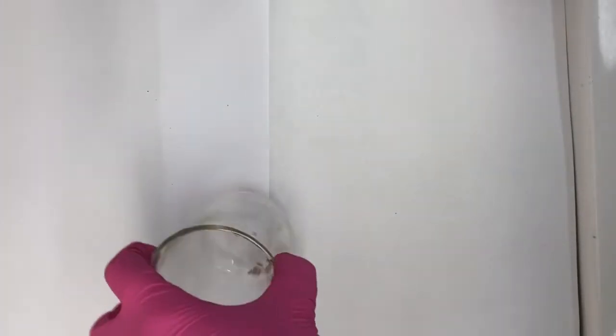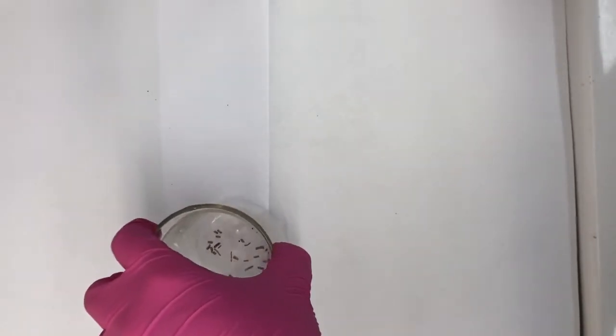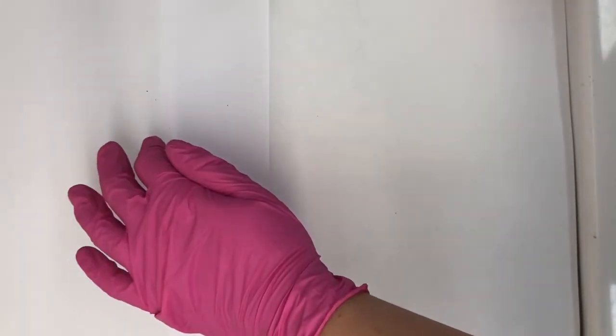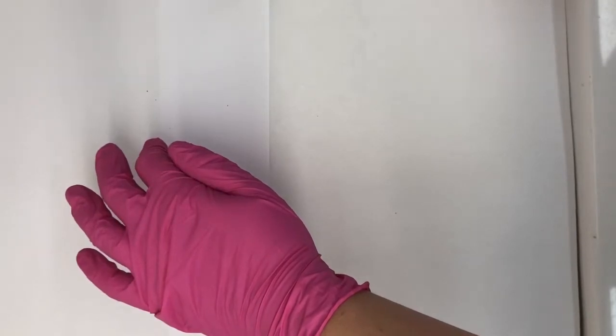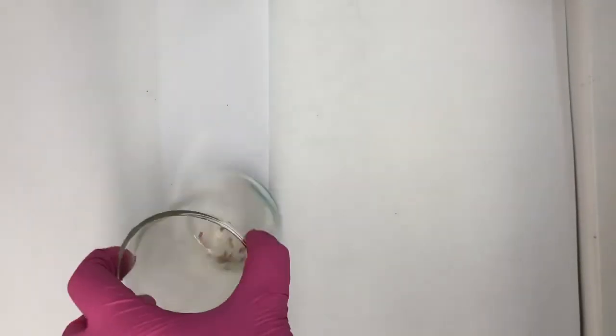Now, it says 40%. I have no idea how long it was up the back of the acids cupboard, which is why I'm carrying out this test. So give it a swirl. And I'm putting my hand over the top of the beaker for reasons that I would like you to conjecture.